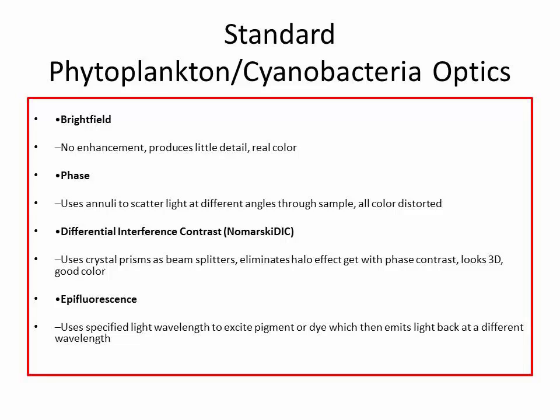But to adapt a scope for Nomarski is several $1,000s in itself. But you can use it a lot. But phase usually gets you what you need to know.